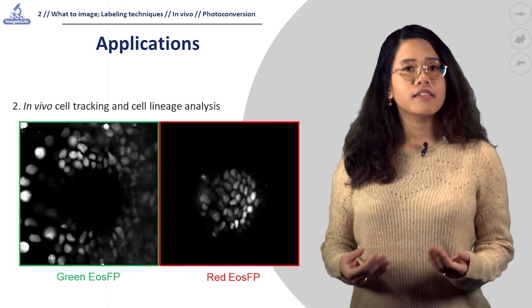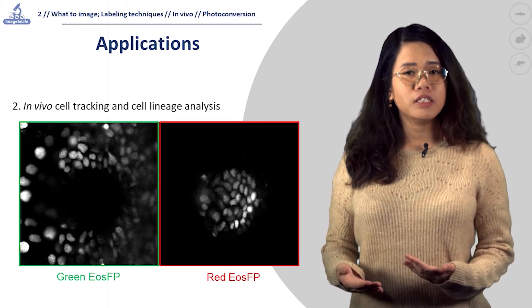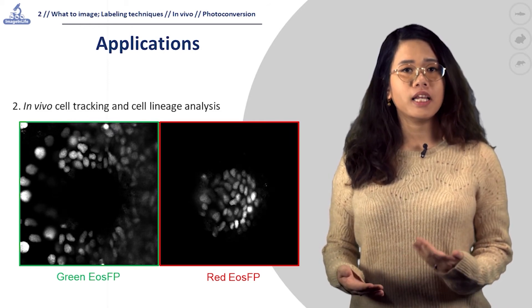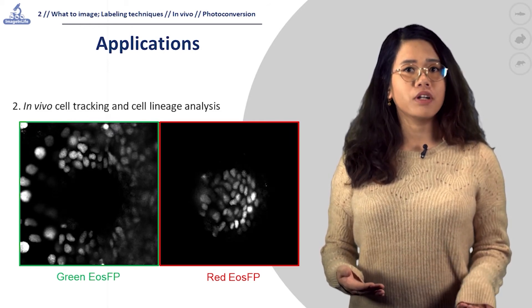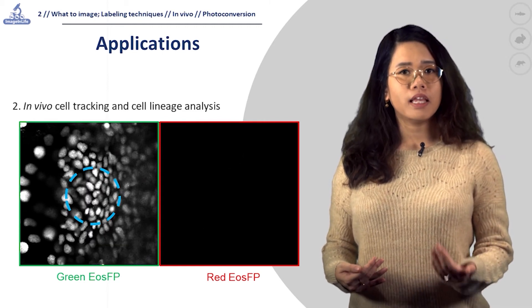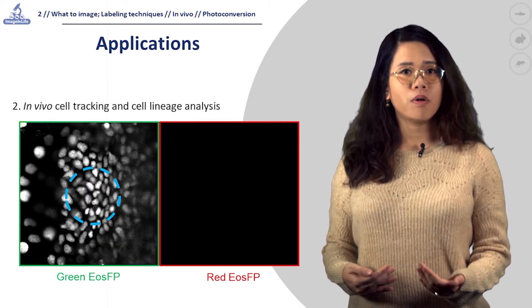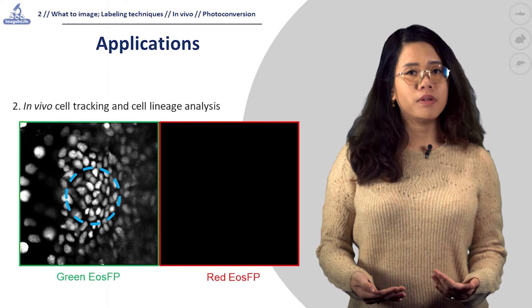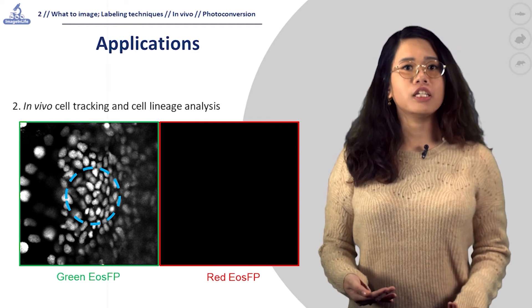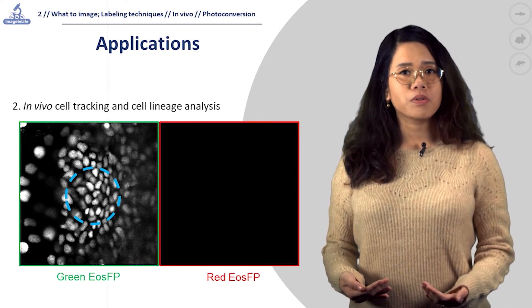This is a section of zebrafish pectoral fin tissue at 28 hours post-fertilization. The embryo has been injected with NLS-EOS mRNA one day prior to this experiment at the one-cell stage.